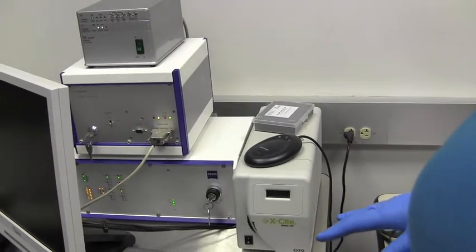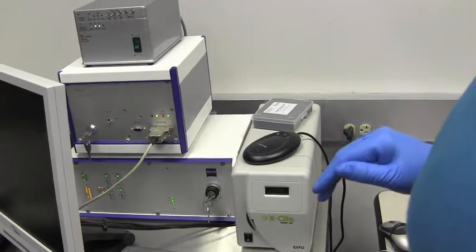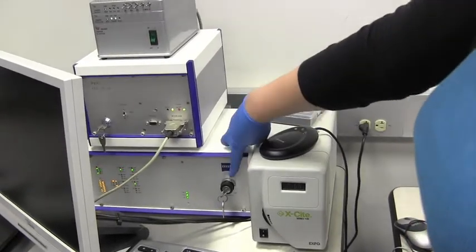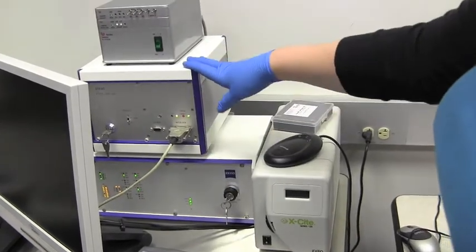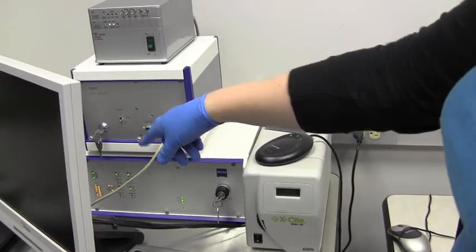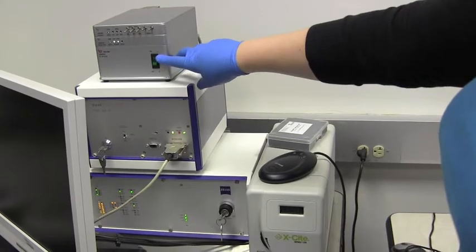Alright, so once you gain access to the room, to the right of the actual microscope are these three boxes. The first controls the actual microscope, the stage, and the laser, and you turn that on first using this key to the on position. The second box is the laser power control, which you turn on with the key over there, and then this controls the filters. That's turned on with the toggle switch.